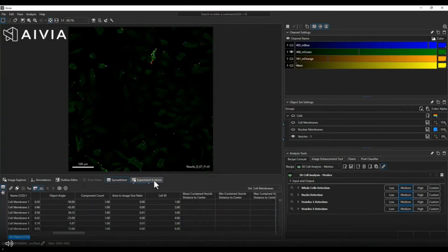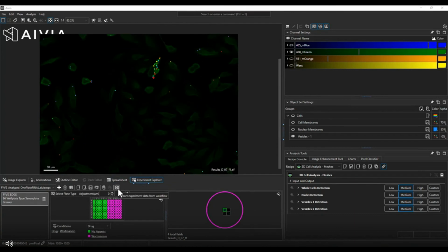Now we're looking at the newly created option to export into a combined CSV file that you see here. So you see this Excel icon that enables you to export all your experiment data per condition you specified, per object, creating this mega CSV file that combines all the data in individual object type per condition so that you can do downstream analysis.